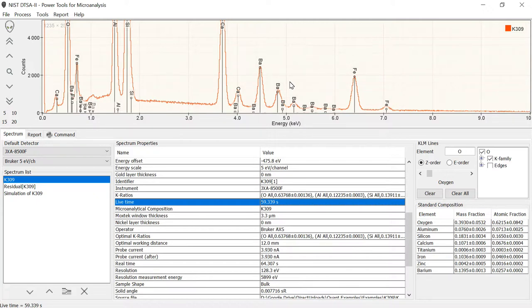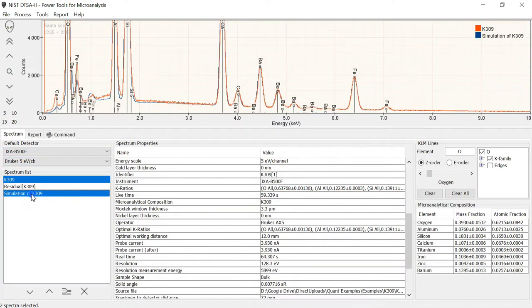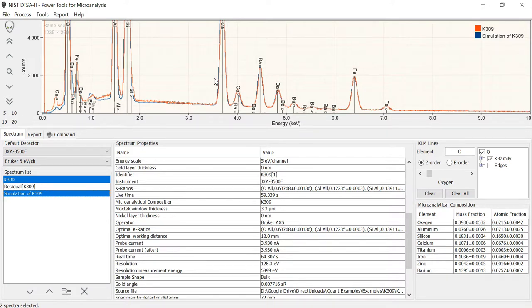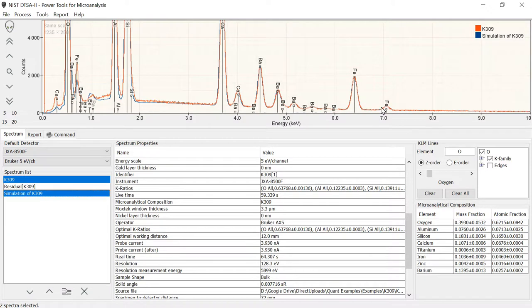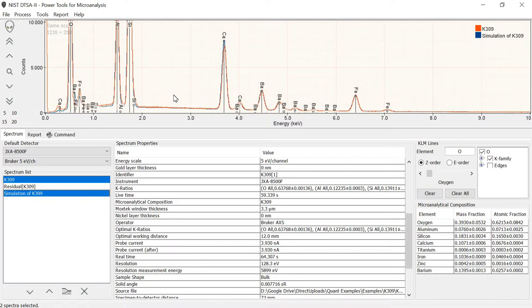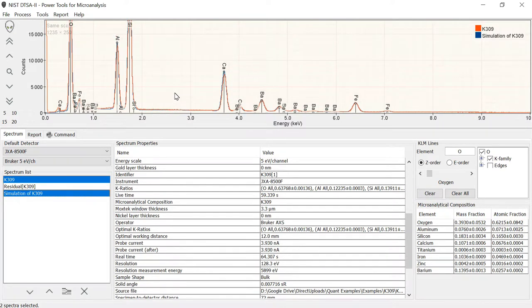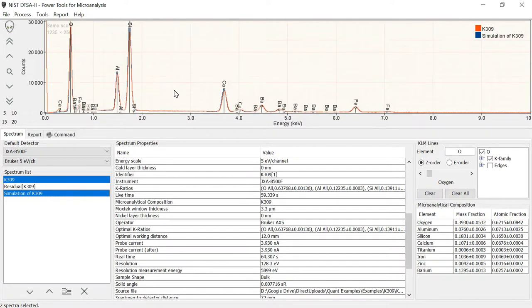You might have noticed when we quantified the spectrum that we did in fact also generate a simulation of that spectrum here too. If I select that, you see that I now overlay this blue spectrum, which is in fact a simulation of the spectrum. This was done automatically whenever you quantify a spectrum.